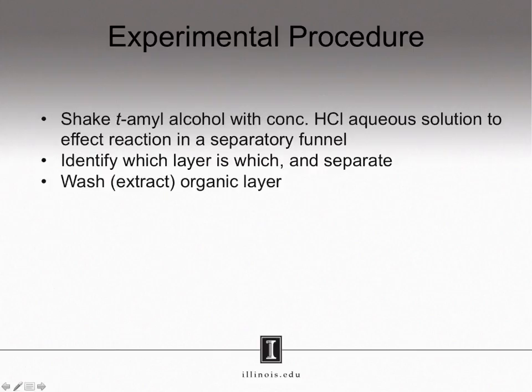You will perform what we call a wash. A wash is simply a type of extraction. Specifically, a wash is usually trying to remove impurities from the organic layer. The first wash you will perform is with aqueous sodium chloride solution, what we call brine. The purpose of using a brine solution is to remove any bulk water located in your organic layer. Remember, organic solvents always pick up at least a little bit of water.